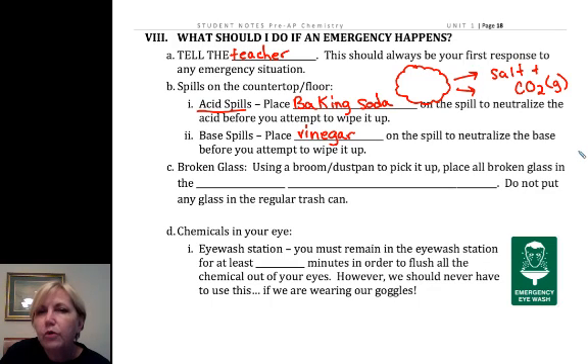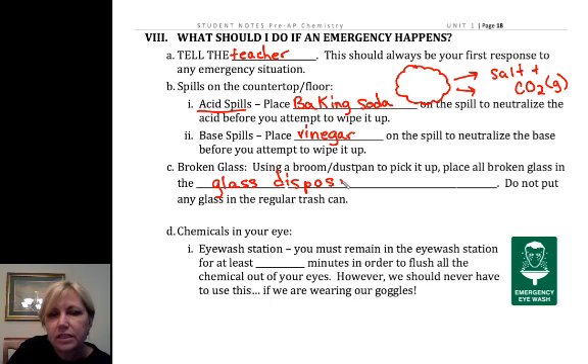If it's broken glass, I will by and large clean up the broken glass, so just come and get me. We do have a special glass disposal box. If you look in the back of my room on top of the back sink, you'll see this glass disposal box. That's where we put broken glass so I can package it up and dispose of it safely.